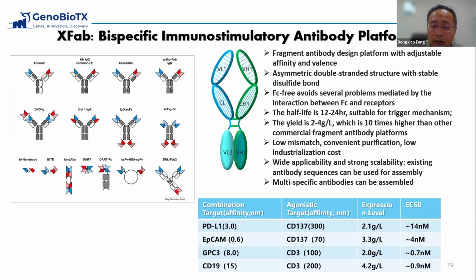For this kind of structure, because this is the FAB structure, the antibody can keep its original affinity, so you don't need to optimize the structure if you don't use the SCFV structure or other form of a bispecific antibody. And you can also make multiple therapeutic antibody in this structure. The most important thing is that this antibody can be easily purified with a protein L resin, just like a protein A we used for monoclonal antibody for purification.